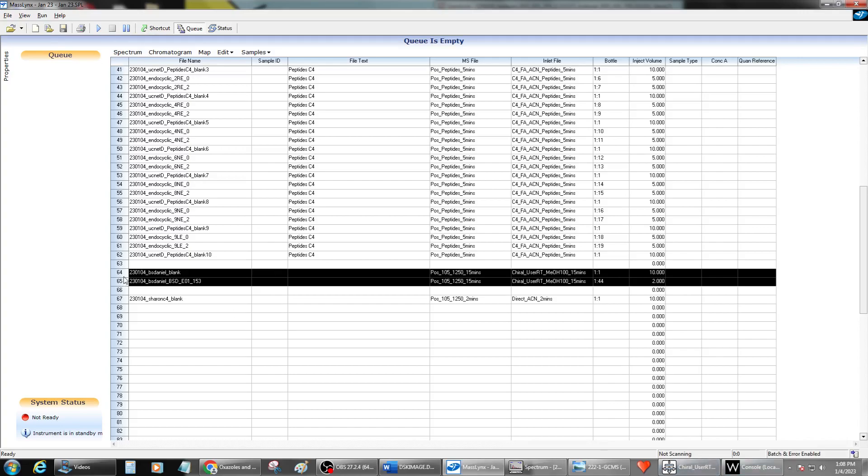So if you see the pause depressed, you want to unpause by clicking on the depressed pause. So it is gone. Okay, so now I'm going to go ahead and check the auto sampler. There is no vial in position 44. So that is the mistake.